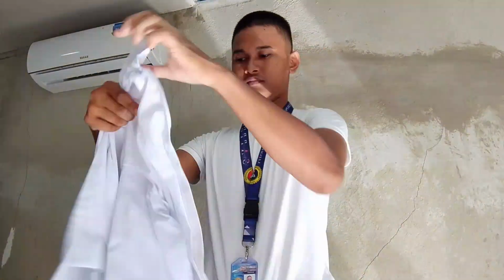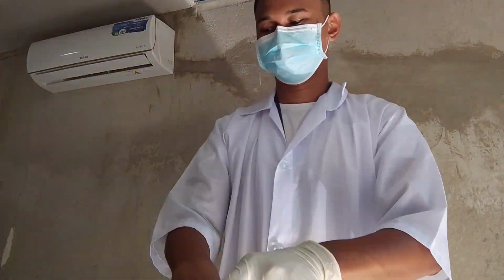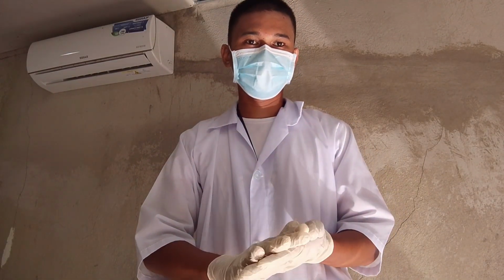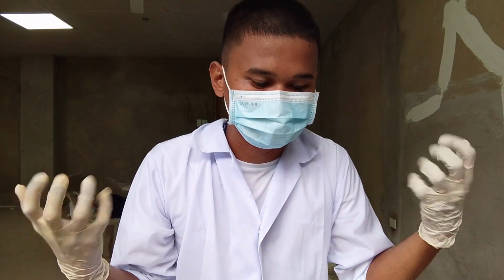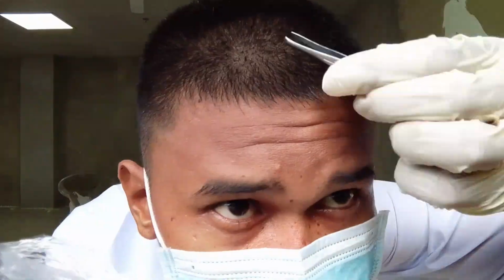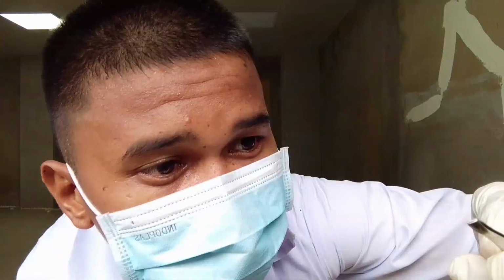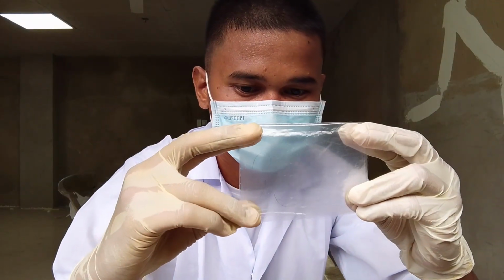Before I start this activity, I will first wear PPE. I am done wearing PPE, so I will now proceed to the first procedure in activity number 5, collecting a human's hair. First, I will collect hair from the head. I am done collecting the human's hair from the head.